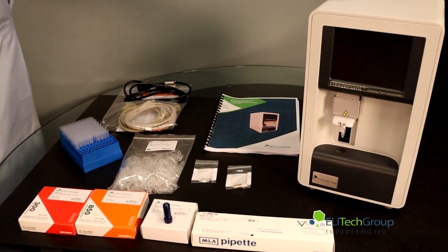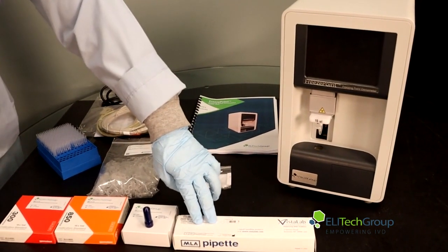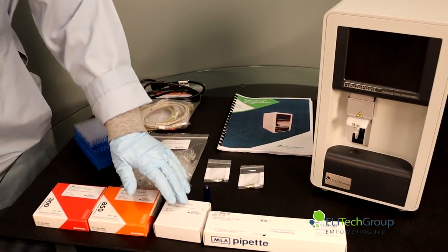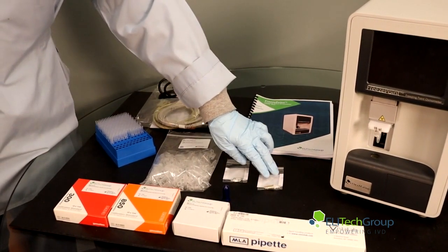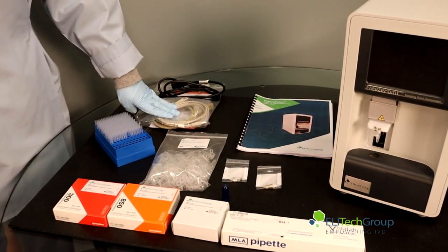This is LA Tech's freezing point osmometer. With this you will get your instrument, your micropipetter, your ampule opener, and your three standards — the 300, 850, and your zero. You will get your measurement vessels along with your pipette tips, extra fuses, an adjustment tool, a user manual, power cord, and extra cables.